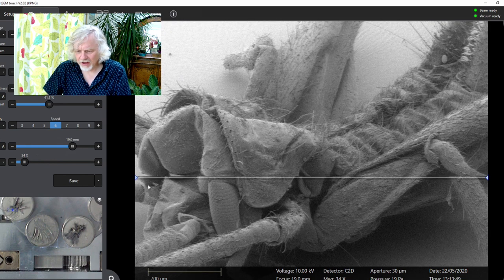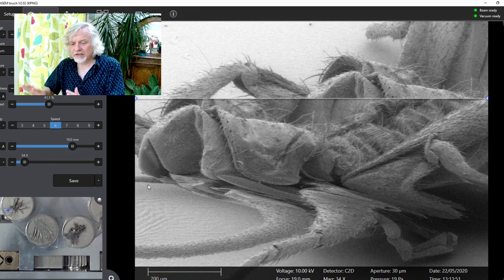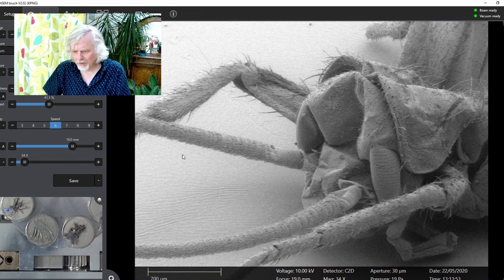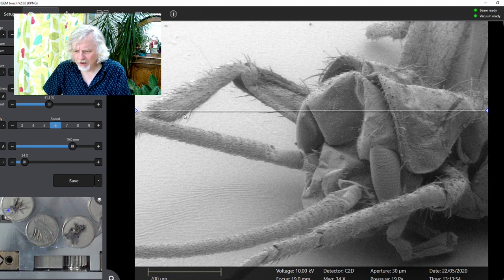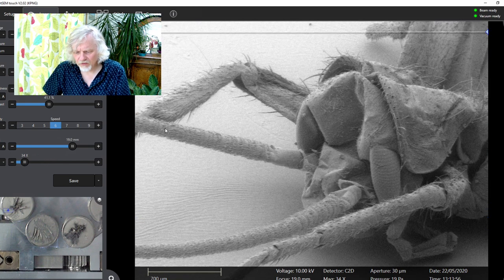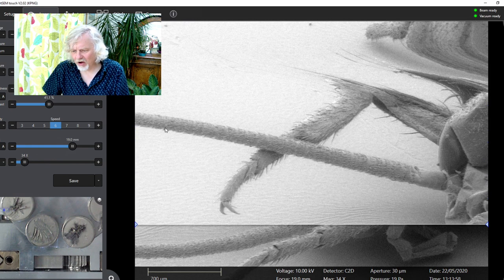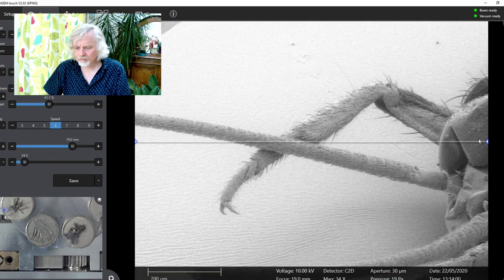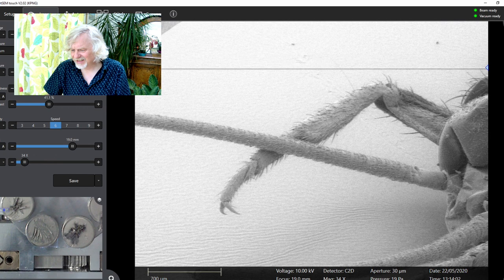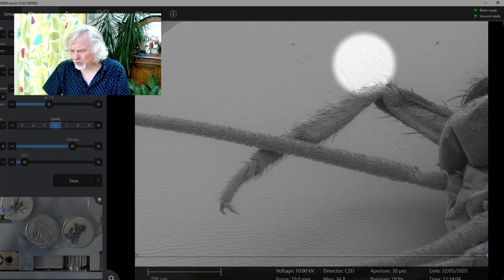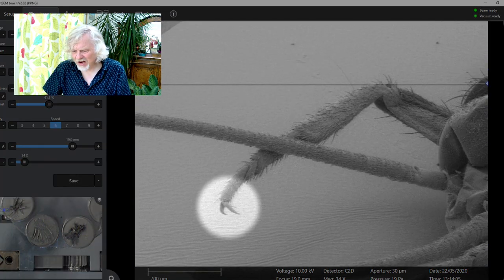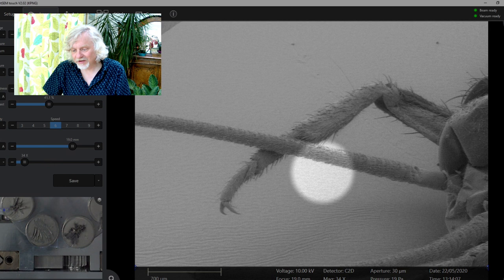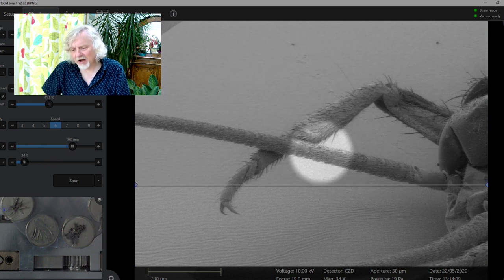So if I move it, I can sort of change where we're looking. I'm going to go sort of there. We'll center on that part. So here's the antenna. Here's the head. There's one of its legs, its front legs, with the claw on the front. And here's the antenna sticking up here.